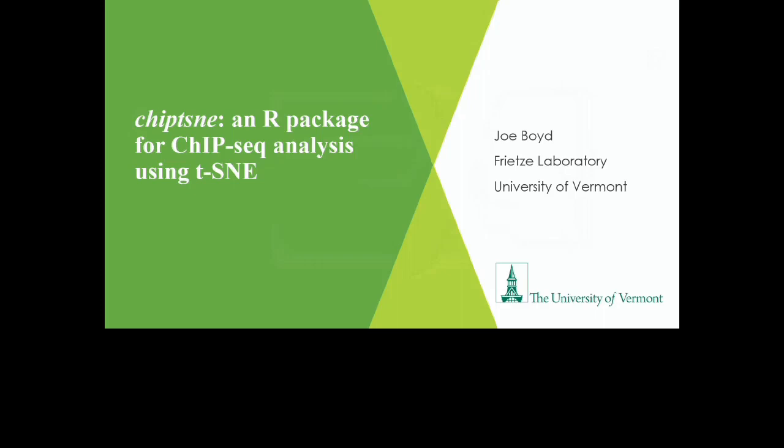Today I'm going to be talking about an R package I've been developing recently. It's called ChIP-tsne, and it's basically an application of tsne in ChIP-seq analysis.